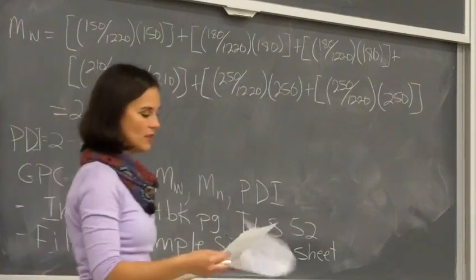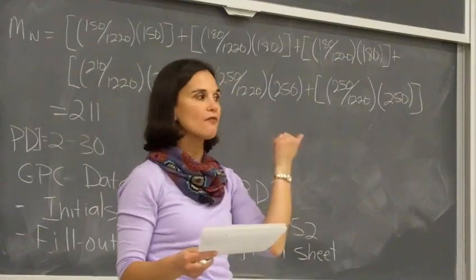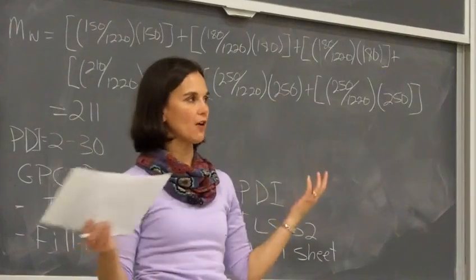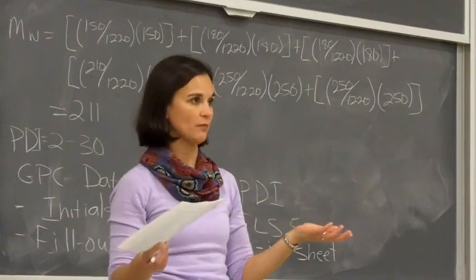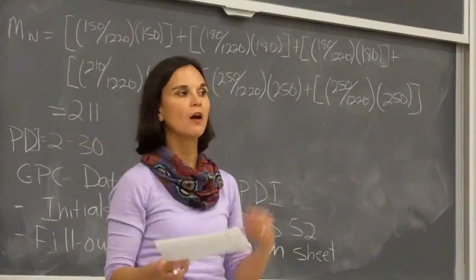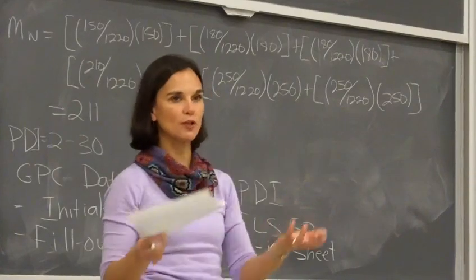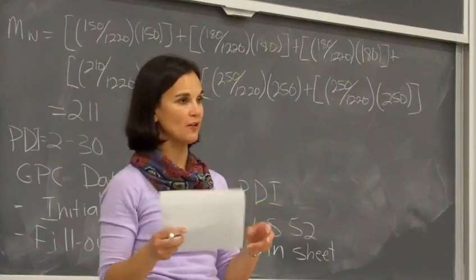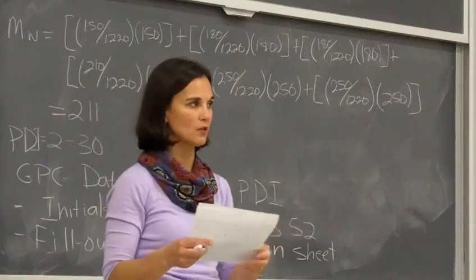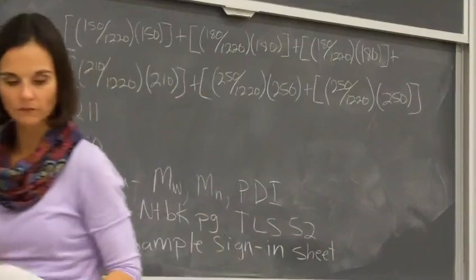And then like I said, if you need to collect IR spectra, you can do that out of lab. One more thing, for the IR, I don't want you guys to all print out, you're going to need a literature IR spectrum, okay? So you don't need to all print out a polystyrene spectrum. I will post a spectrum on Moodle, and you will use that to compare for your literature spectrum, but again, don't everybody print it out from Moodle, just use it on Moodle to compare to your data, okay? All right.